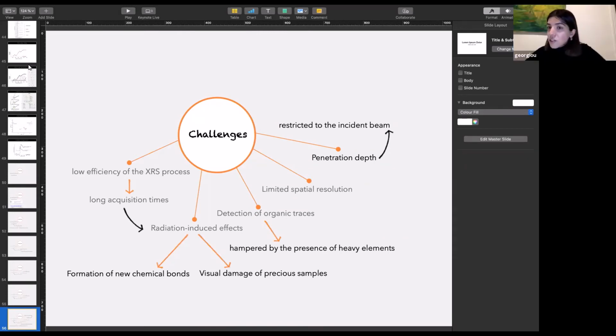Well, the upgrade is primarily going to improve the brightness, right? The ability to focus and to maintain the photon properties over various conditions, let's say. Well, I think a beamline scientist, especially Christophe, would be the best to answer, but I think the brightness will improve the long acquisition times. Maybe we could acquire XRS spectra faster. This is what I would say.